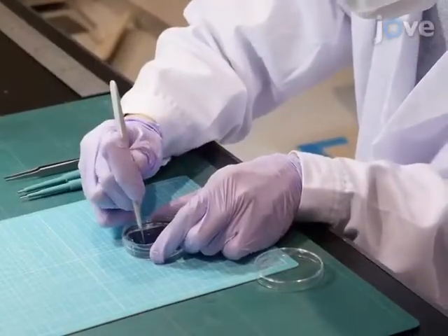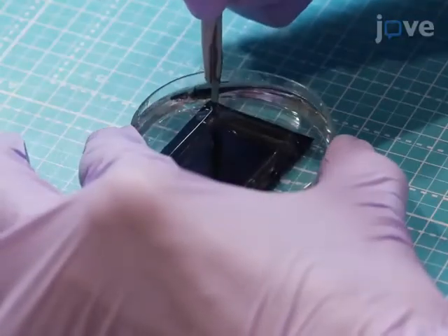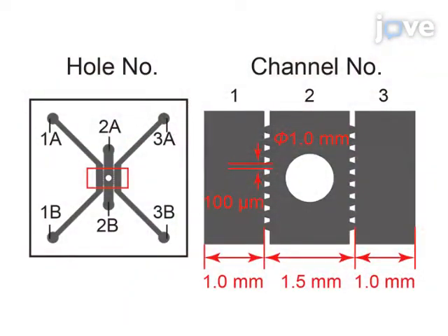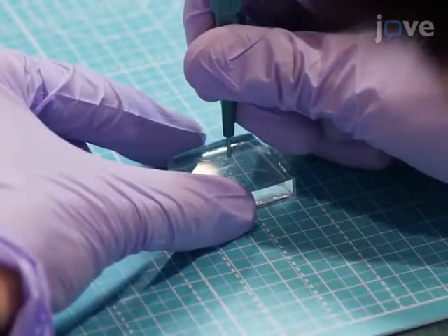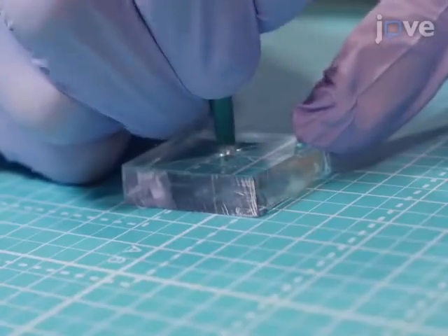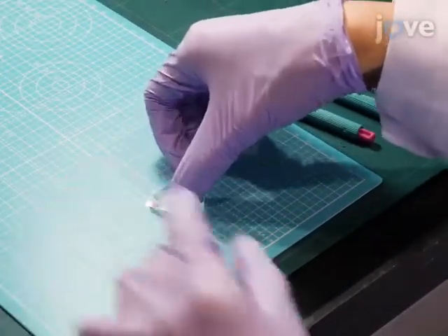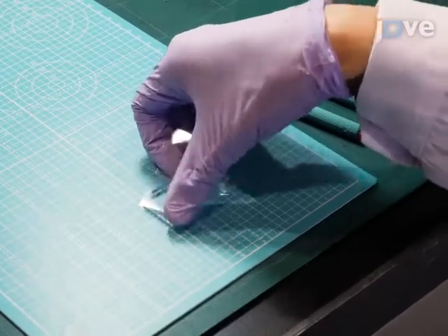The next morning, peel the PDMS from the silicon wafer and use a 2-millimeter-diameter hole punch to create holes in the material at the indicated positions. Use a 1-millimeter-diameter punch to create the spheroid well, and use adhesive tape to clean the PDMS slab and a 24-by-24-millimeter glass coverslip.